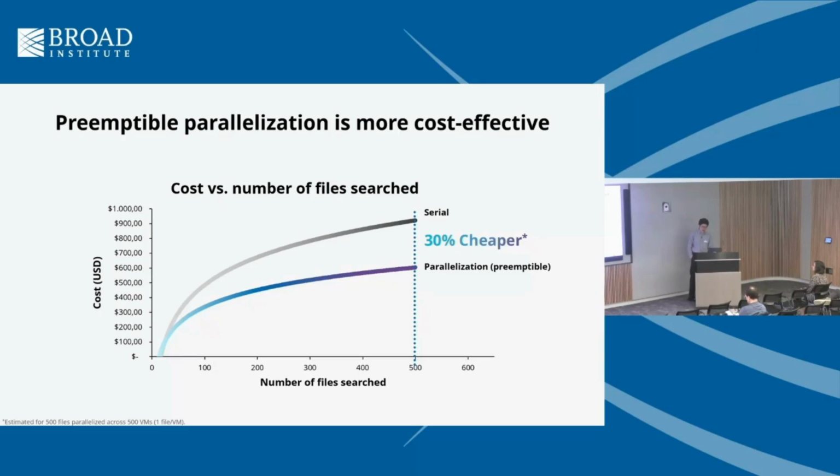But the bottom line is that now the runtime and cost improvement makes the large-scale directDIA searches more practicable to run in a cloud environment. And with the parallelized workflow carrying out at this speed and cost, the next question naturally will be how consistent are the IDs and quants compared to the serial workflow?